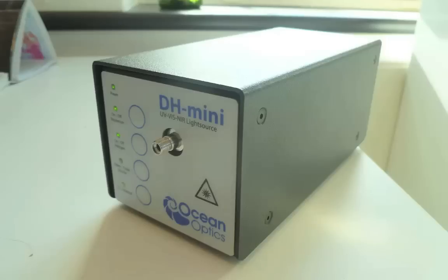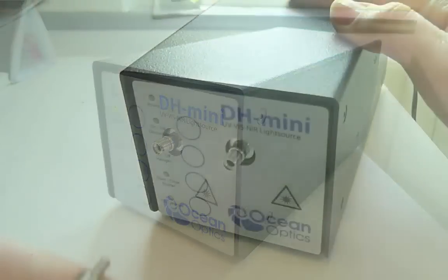This broadband light source will maximize the information we can get from our sample by covering the regions where the sample absorbs most.